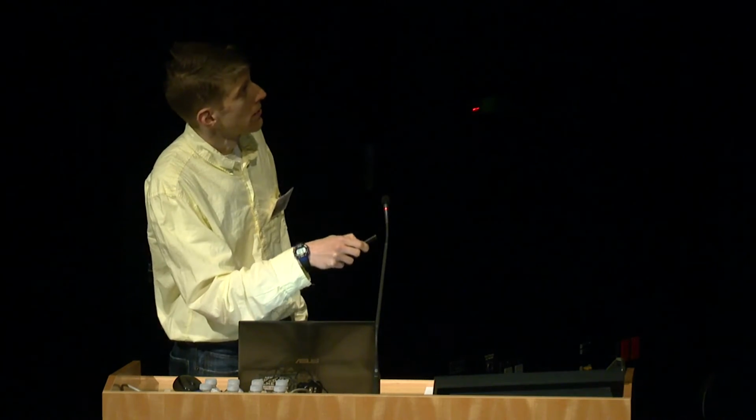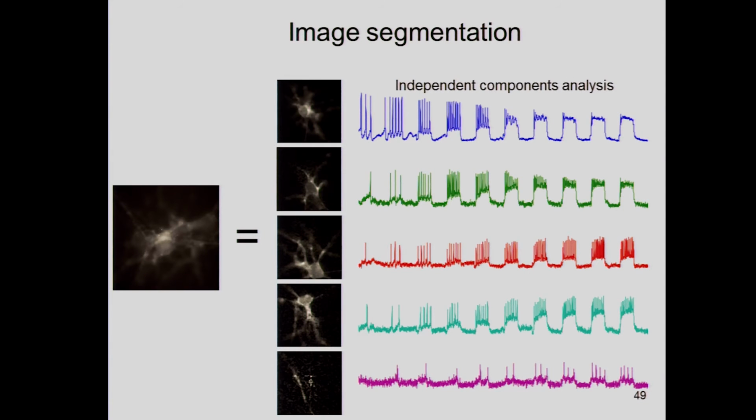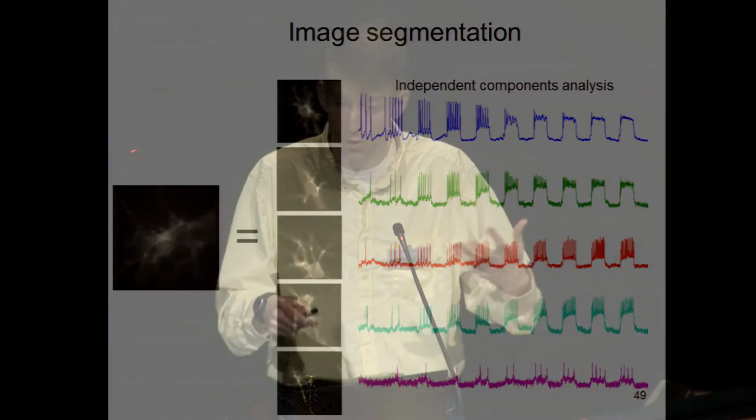Now, this data points out something important about this kind of measurement. These cells are all genetically identical, and they're all cultured in the same cluster. So they're as close to identical as you could possibly hope for. Yet you see very different firing patterns. And this really emphasizes why it's important to have high throughput measurements for optical characterization of the cells. There's a lot of variability in these cells, and you really need statistics to overpower that. So we took recordings like this for a couple of hundred cells with the ALS mutation and a few hundred without the mutation.